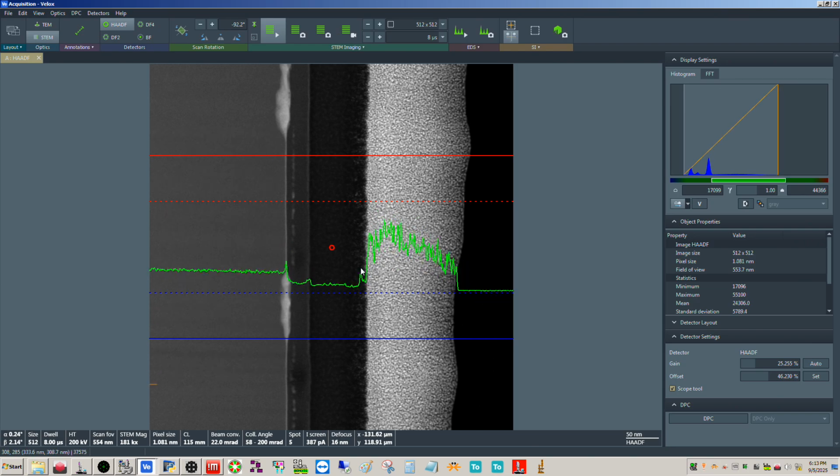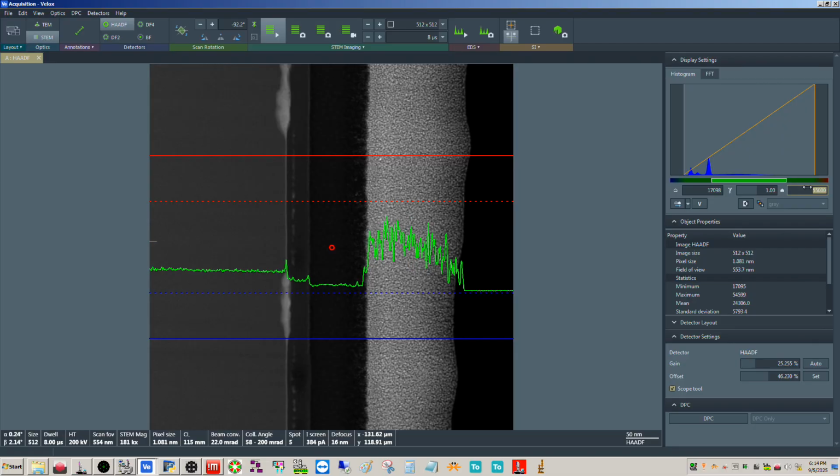In something like this, which has a really high dynamic range, you have really bright areas next to really dark areas, it's not uncommon to get a little bit of clipping with your image because of how it's doing the auto levels. So just something to keep in mind. But again, you can alleviate that, just disable auto levels, and then you can put whatever you want here, okay? So if your max is 55,000, put 55,000. That's not going to change this slider here, okay? That's independent. This is just what you're setting the contrast limits to be, okay?